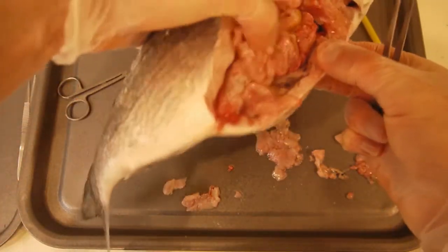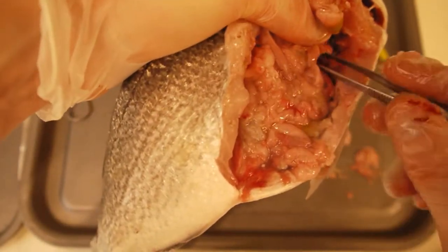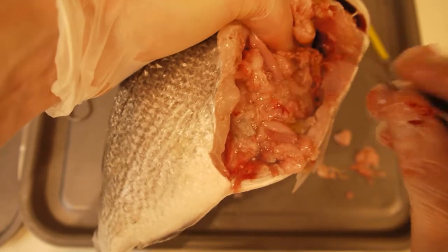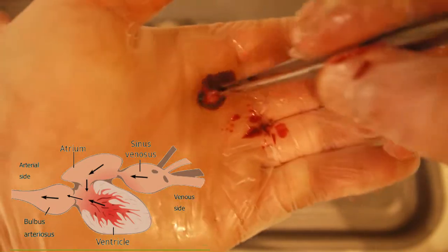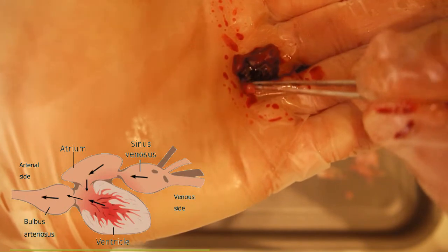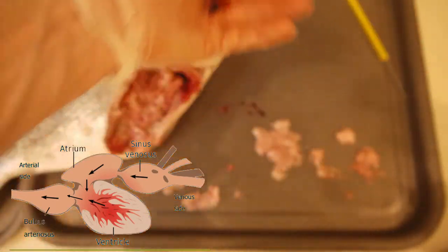Now let's have a look at its heart, which is just over here — it's going to be a bit difficult to get to. The heart in a fish is, of course, two-chambered; it just has an atrium and a ventricle. It also has the sinus venosus up front and bulbus arteriosus at the back. There we are — here is the heart. Hopefully you can see the two chambers: the atrium there and the ventricle there. Unlike humans, fish have a single circulatory system. Let's put the heart to one side.